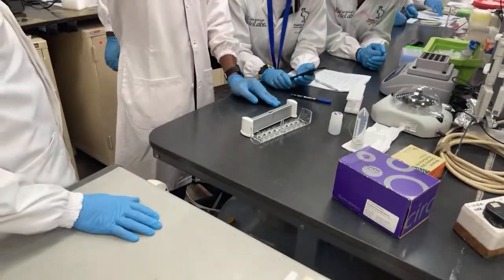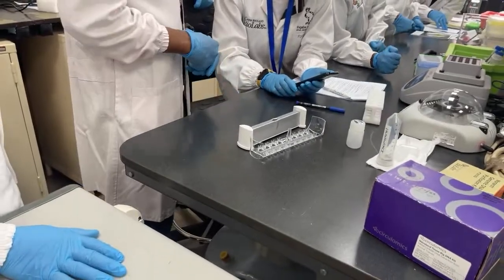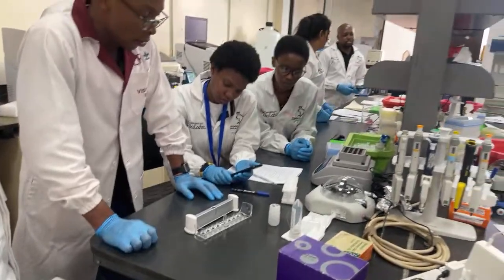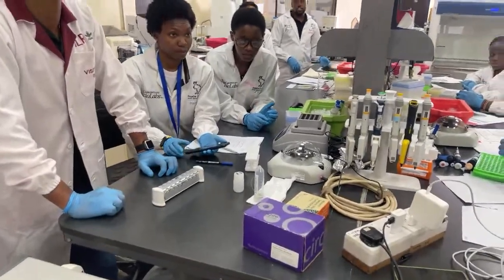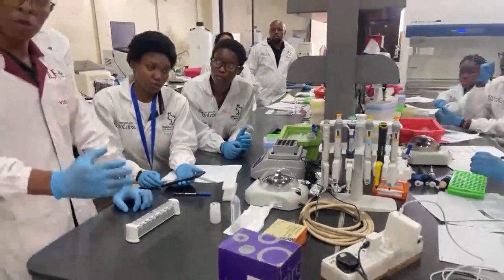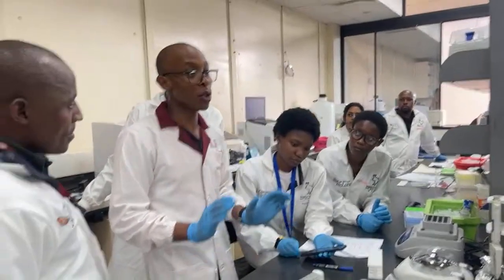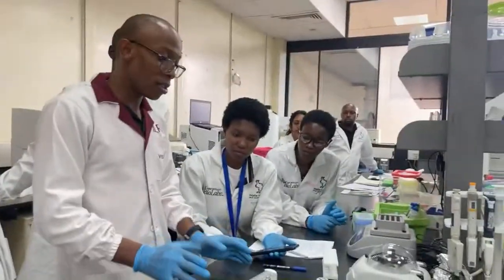The disc should still be a little bit up. That's the purpose. How much time left? 6 minutes. Okay. So, you take out the liquid, or you're taking out the disc? No, you take out the liquid, because we have to do some washes on the disc. This is where, if you don't do it right, you lose the DNA.